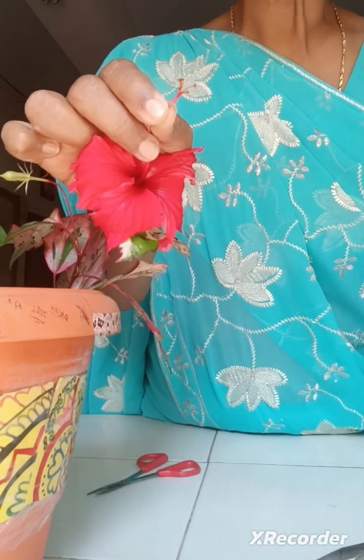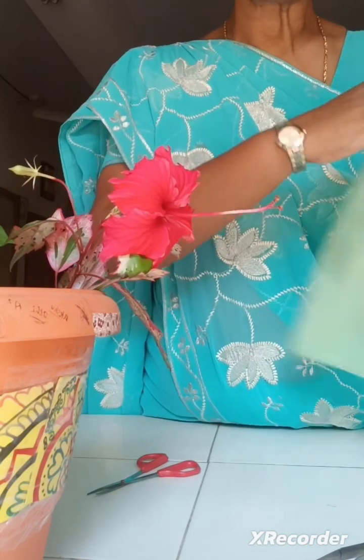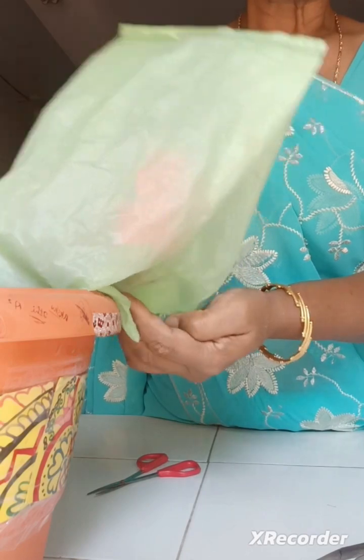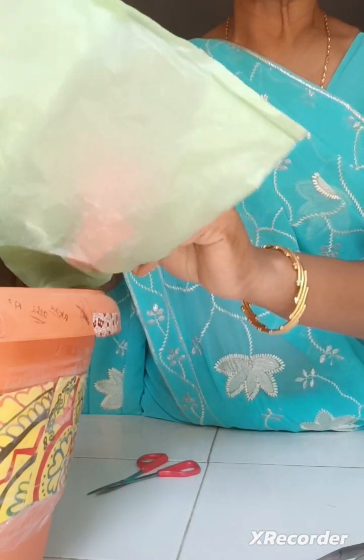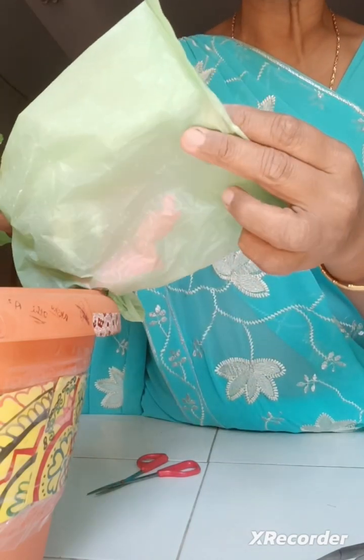After this, we are covering the flower with a polythene bag. I am using a green colored polythene — you can use any transparent polythene as well. While tying, you have to allow some air movement in the same direction.